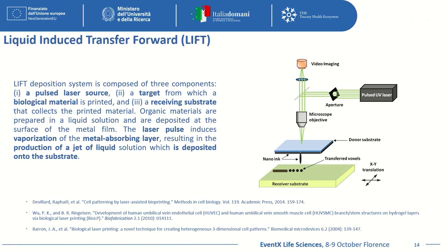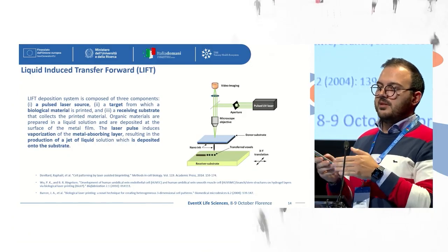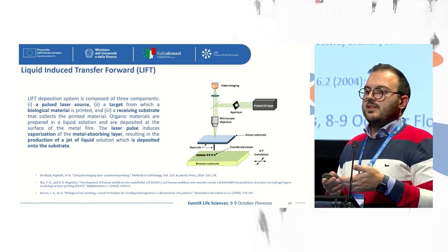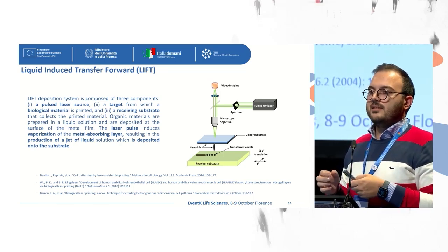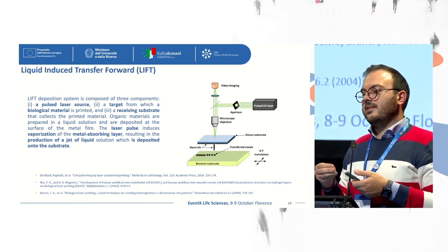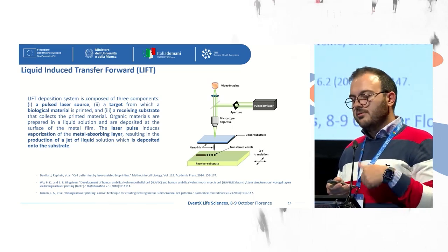So here we have also a higher resolution than the previous one, the resolution of a single cell. So we are talking about 10, 20 microns. And in this case, the viability of the cells is very high because cells do not have to pass through a nozzle, so there is no damage to the membrane of the cells. So this is the technology where the resolution is higher.